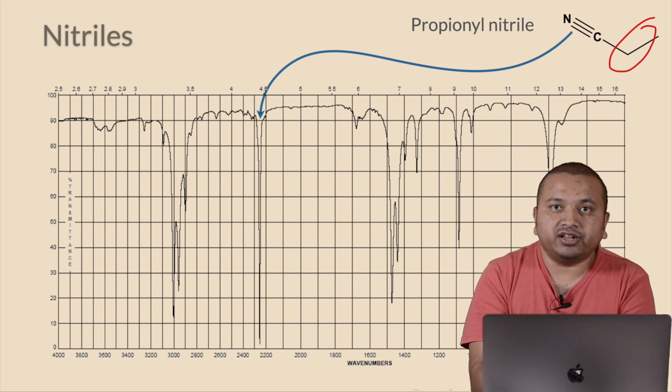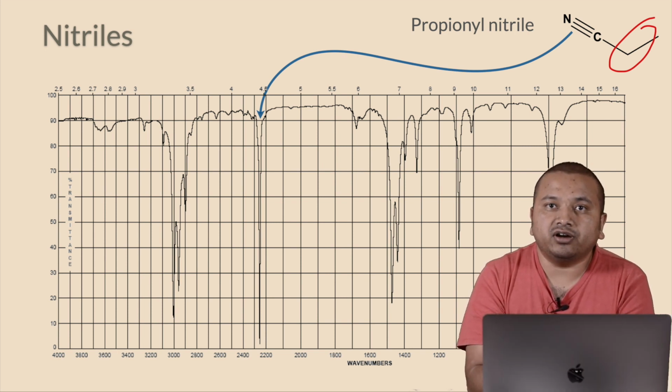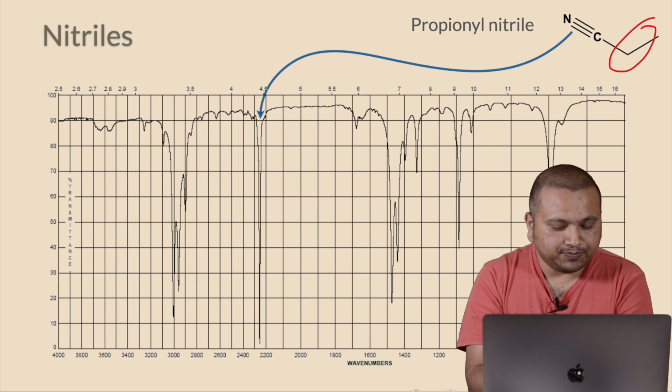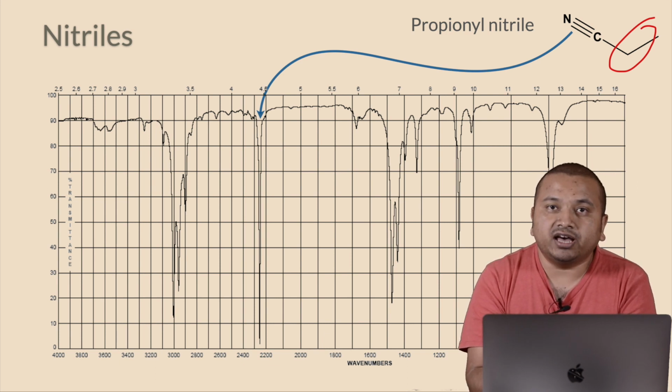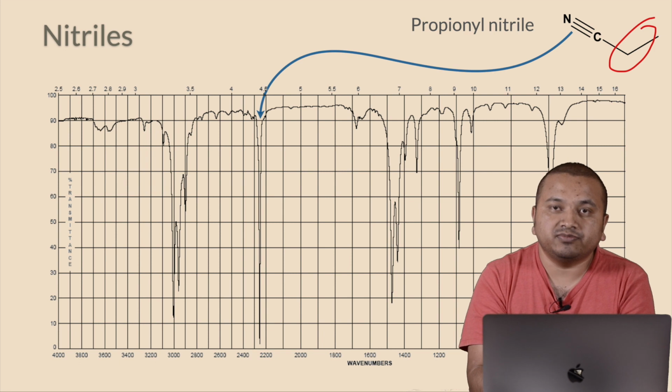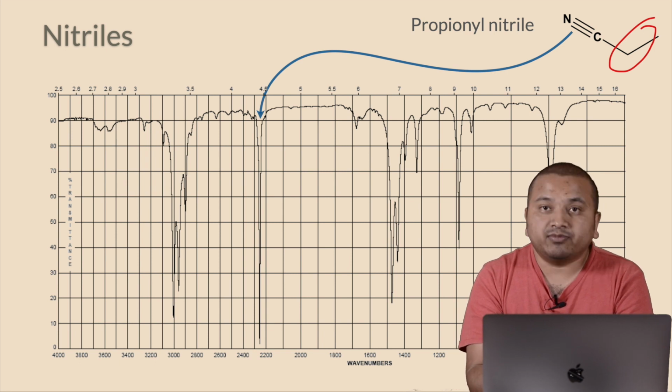So these are the different groups of other functional groups apart from the hydrocarbon that we have seen in the last lecture. So we have seen the alcohol, we have seen the ether. Alcohol has a broad spectrum, ether is missing that OH group peak, and then we have the carboxylic acid.